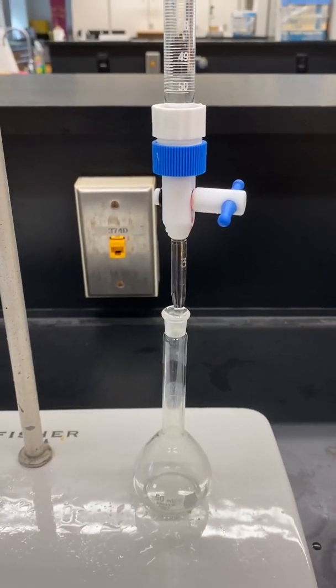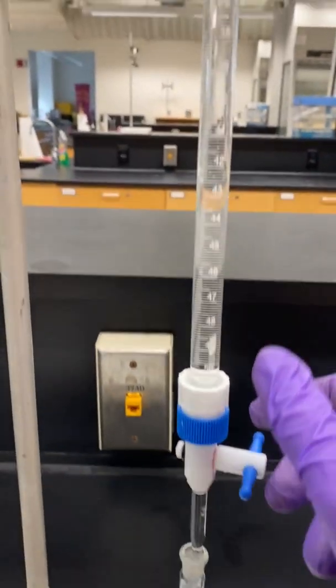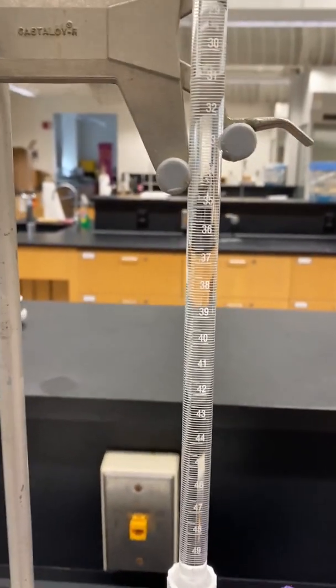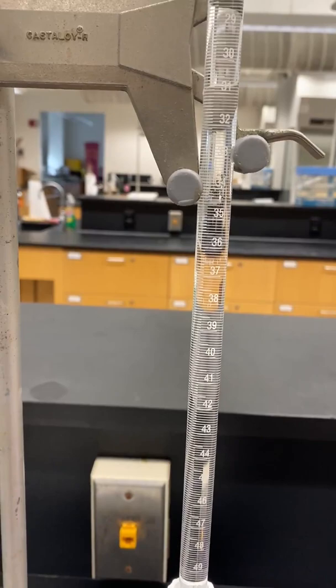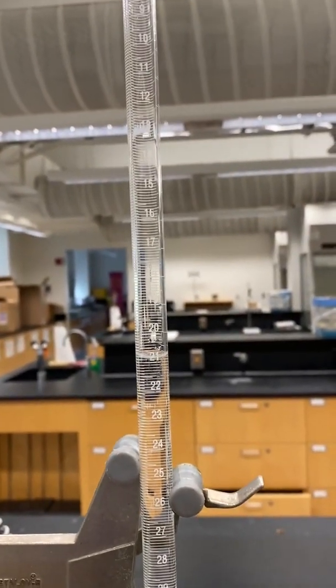Using a clean, dry 50-milliliter volumetric flask, add the appropriate volume of Stock 2 from the burette into the volumetric flask. For solution number A, we want to add 1 milliliter, so we would drain from 20 down to 21 milliliters.